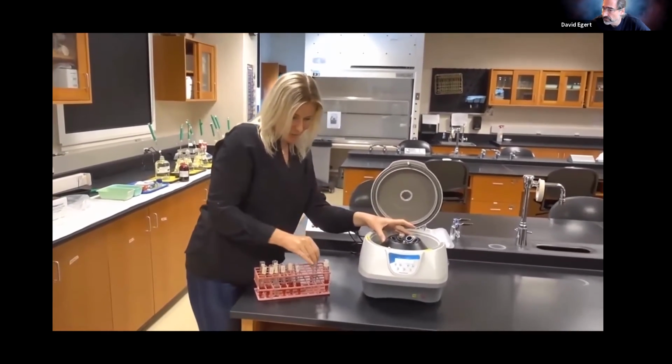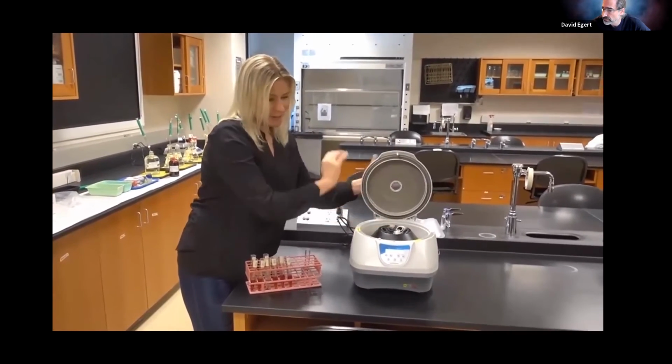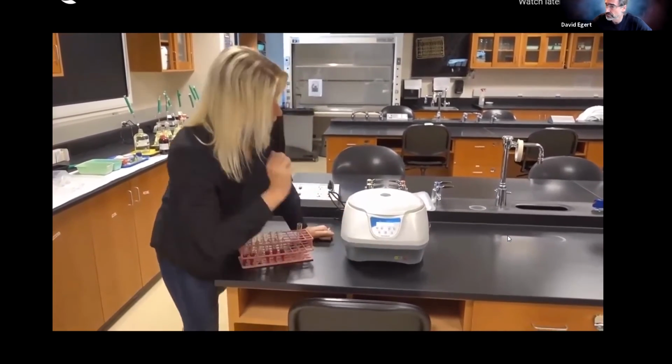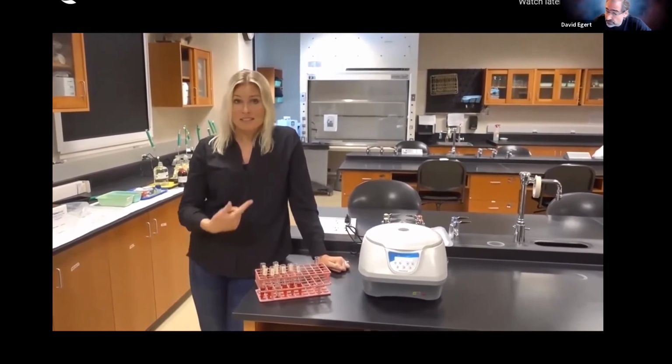In this case, since I have our special number 9, I'm going to stick it here, right across from the other, and we can start this centrifuge up one more time. One of them has just been in glycerol for 5 minutes, because it was waiting while the other ones were spinning. But number 9 has been sitting for almost an hour, the blood cells sitting in the glycerol solution. We'll come back in 5 minutes and take a look at that.